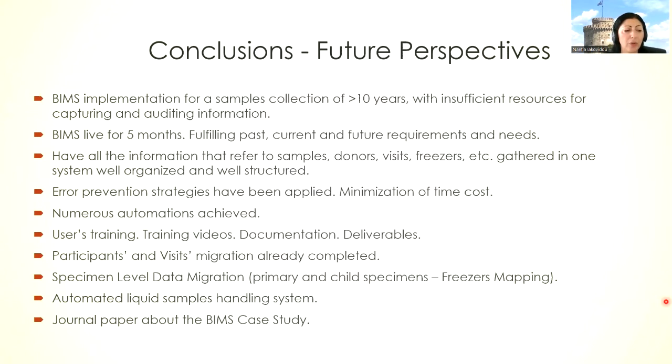To conclude, overall, the task of designing and implementing an information management system for a biobank that had already been collecting specimens for more than 10 years now, while using insufficient resources for recording and auditing information, it was a really painful and difficult task. It was just recently that the biobank got enough funding to build a biobank information management system. And unfortunately, it required a lot of time and effort to finally produce the finalized systems and users' workflow, while at the same time fulfilling past, current, and future biobank requirements and needs.